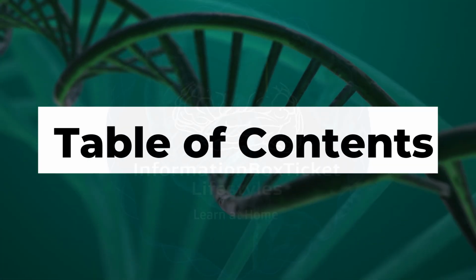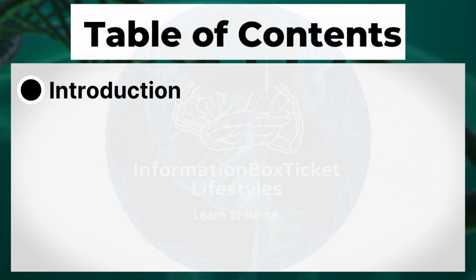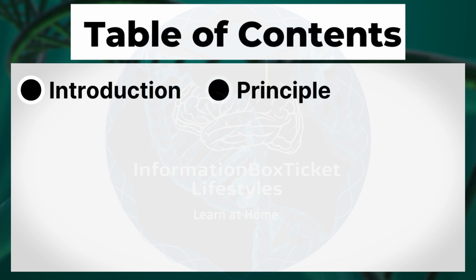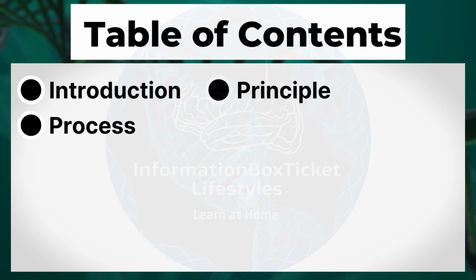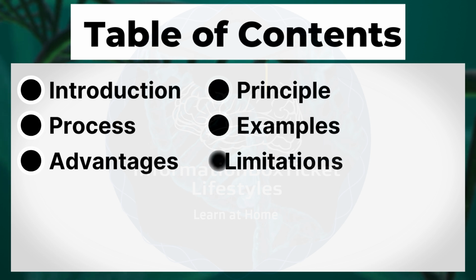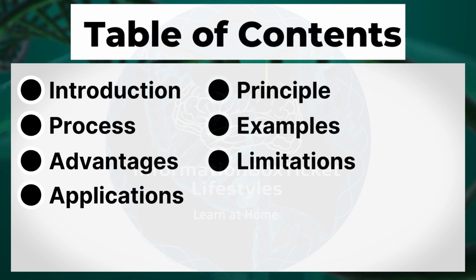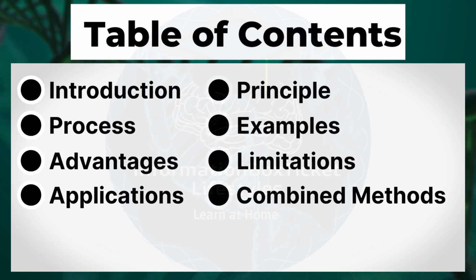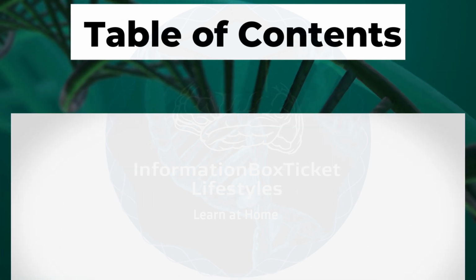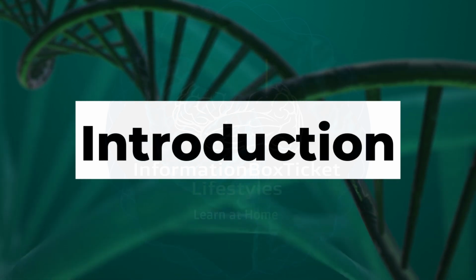Table of Contents. Introduction to short read sequencing. Principle, process, examples, advantages, limitations, applications. Combining short read and long read sequencing methods. Introduction to short read sequencing.